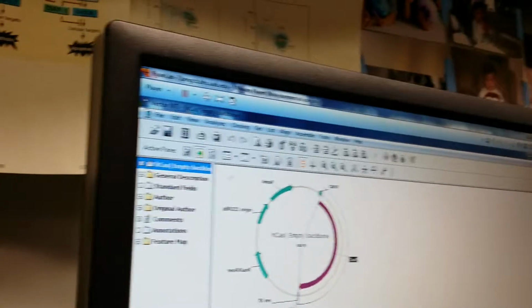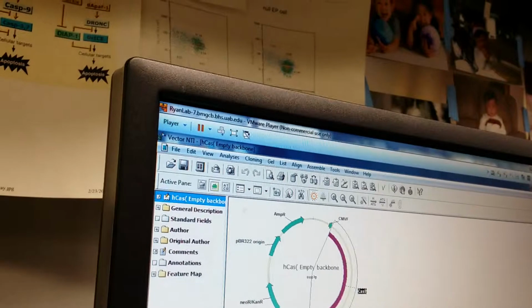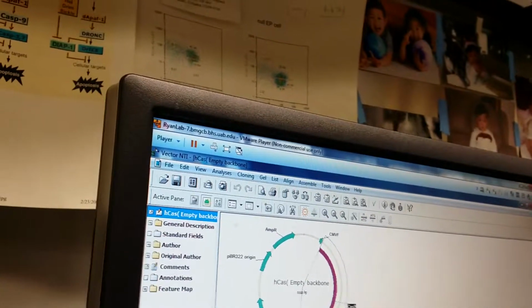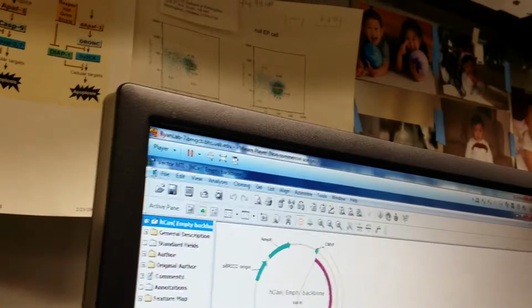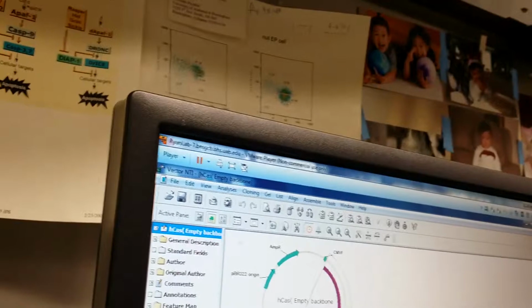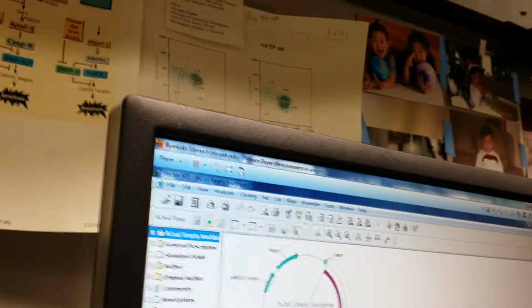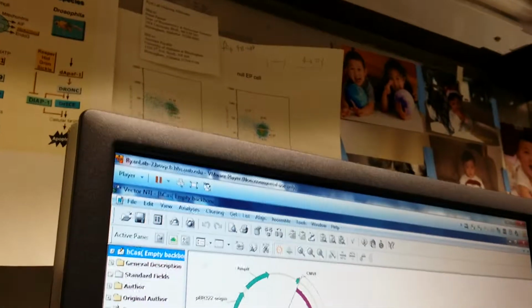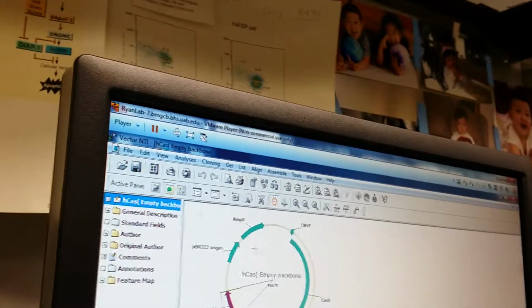Do you put the DNA into those cells, or the RNA or protein? Just prep DNA plasmid. You purify the plasmid, then electroporate the plasmid into the ES cells. And that's pretty efficient, obviously, right? Yeah, very efficient. Is there a selectable marker? Yeah, you can select by neomycin, the selection marker. Oh, I see, there it is. Okay, so you do that, and then that's CRISPR, Cas.